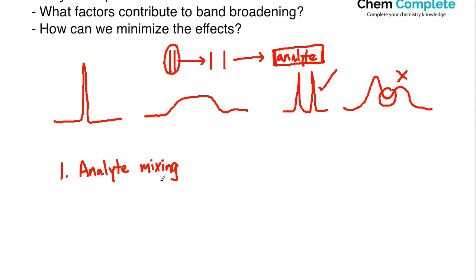So the concept that we're now going to have to wrestle with is, are the analytes separated well enough, or are they starting to bleed together some, right? Normally, if you're interested in purification, you'll collect what's called a fraction. And so there may be certain fractions. Let's say you collect some right here. That's some of the analyte. You collect another fraction from here to here, right?